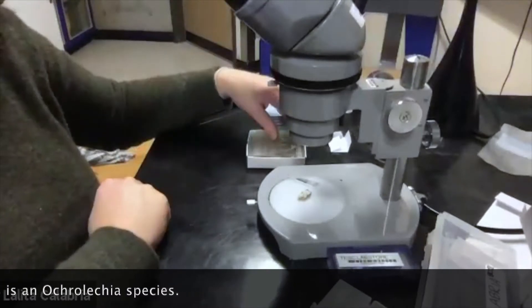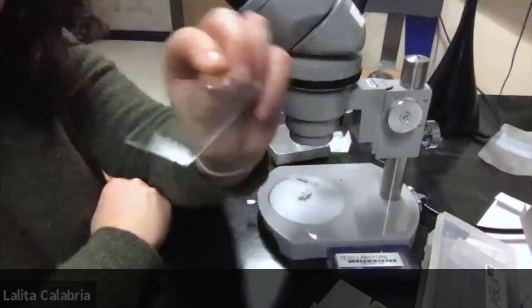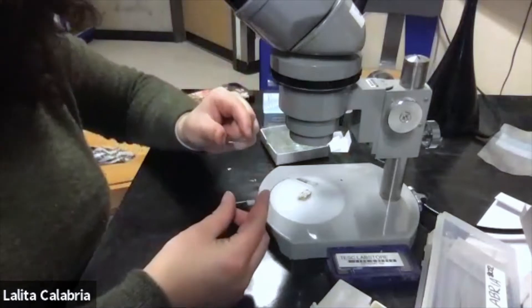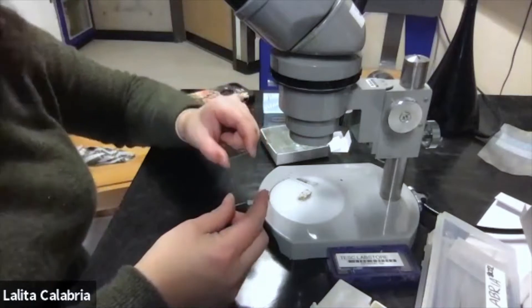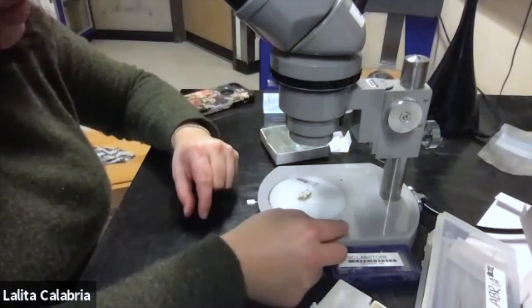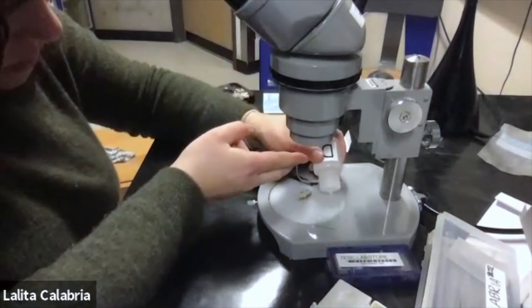You should have received some slides — they're made of thin glass, and you want to avoid getting your fingers on them because fingerprints will make it more difficult to visualize the crustose lichen cross-section. Just set it on your microscope area, then take your DI water and put a little drop right in the center.